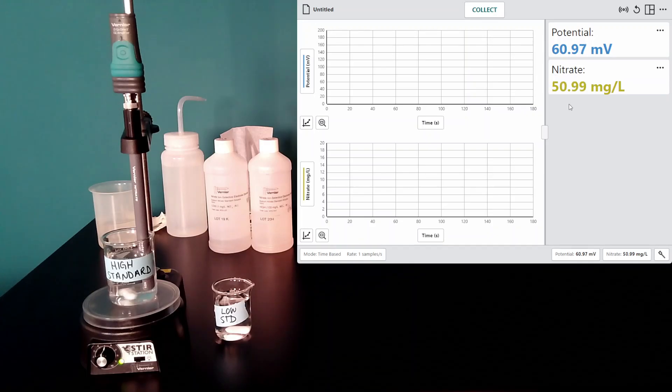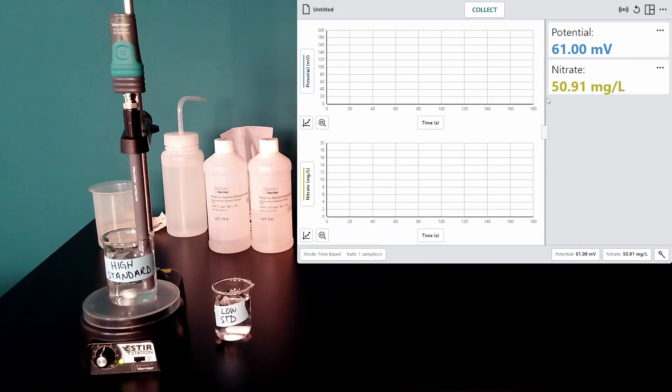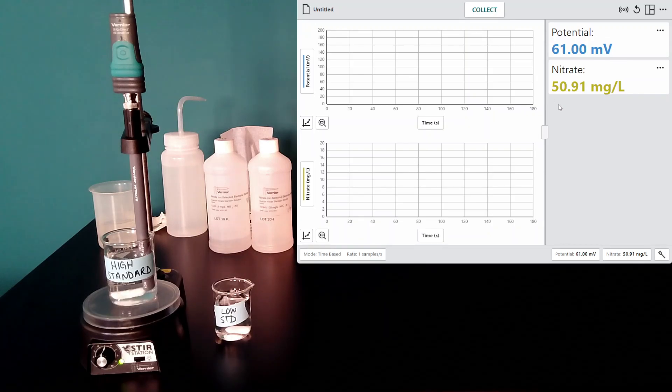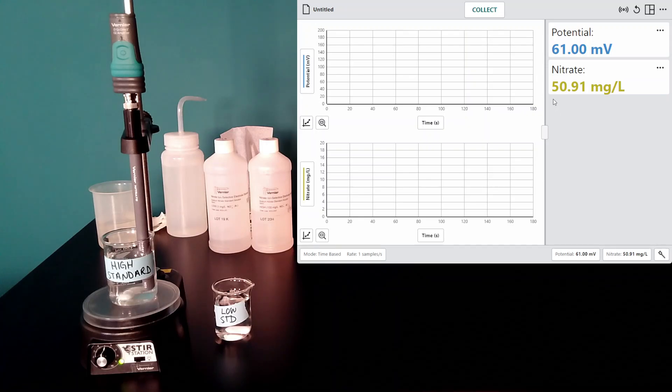However, my milligram per liter is quite a bit off. This standard should be 100 milligrams per liter, and it is reading 50, so I want to recalibrate.